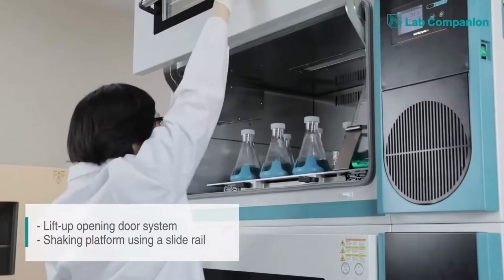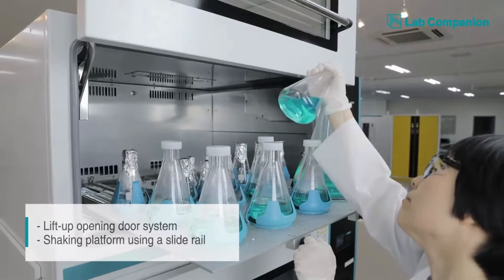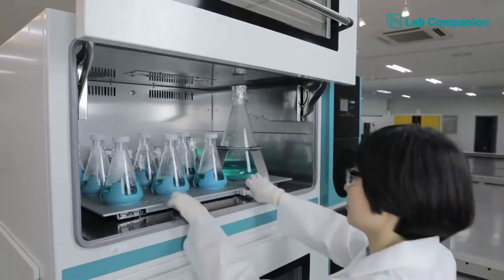Lab Companion's stackable incubated shaker allows easy and safe access to the samples. With a lift-up door and slide rail platform, the user can easily check on the incubation status and replace a flask with the minimum disruption.